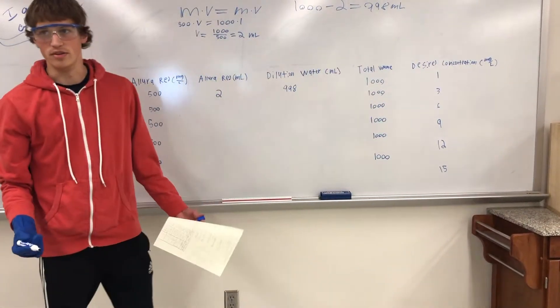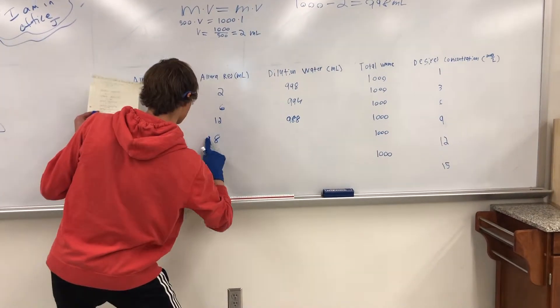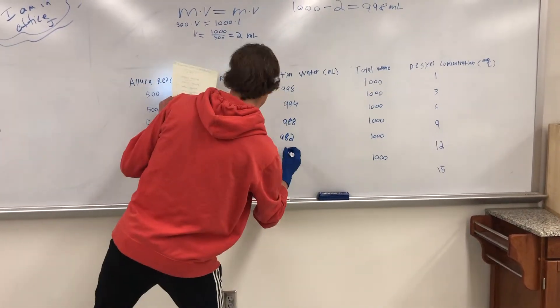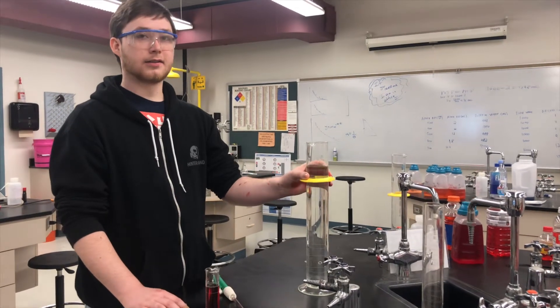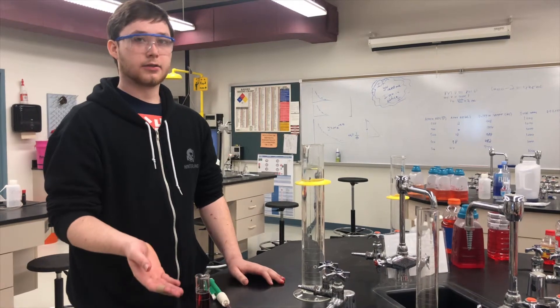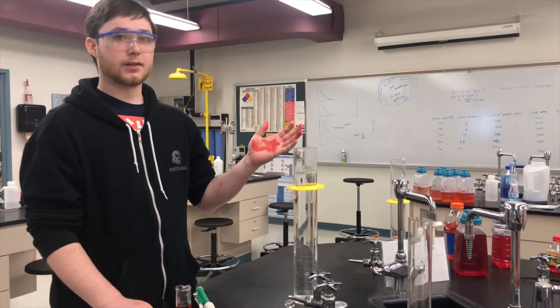And if we use the same method, we locate it. All right. As you can see, I've got my 998 milliliters of water. Here I have the Valora Red stock solution. As you can see, very dangerous.